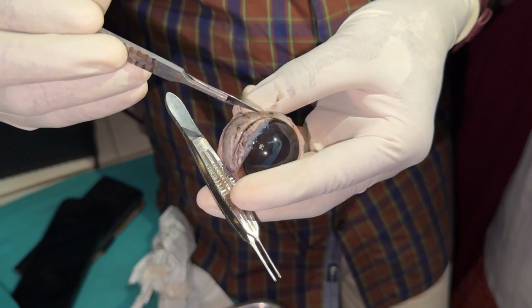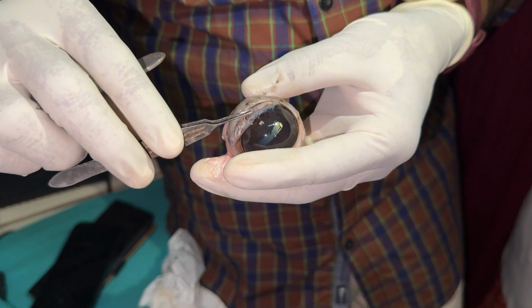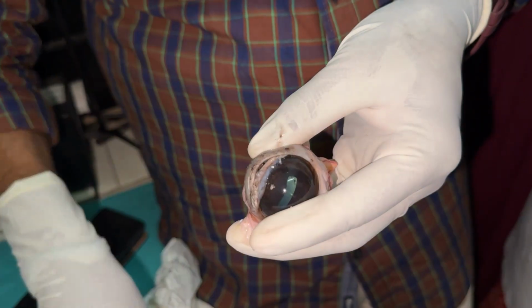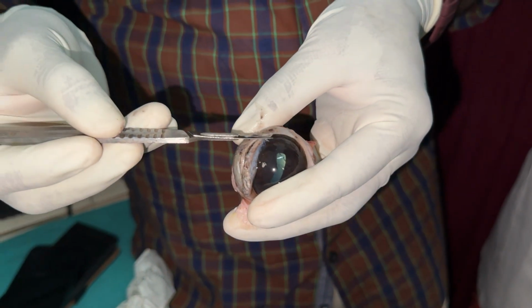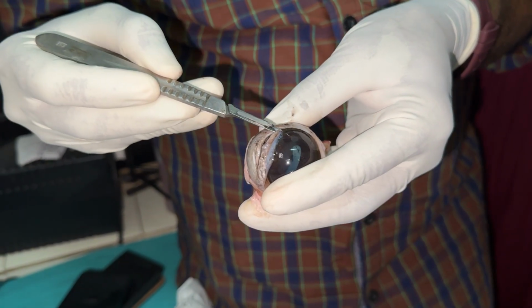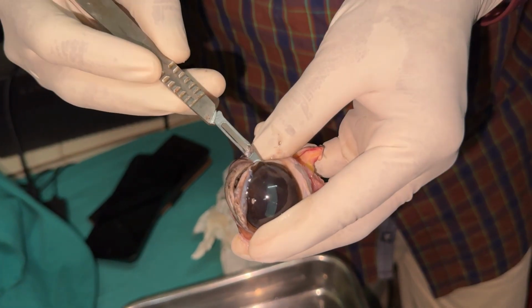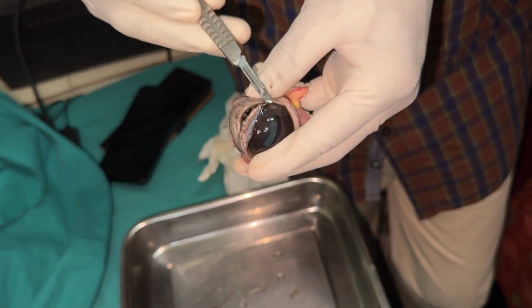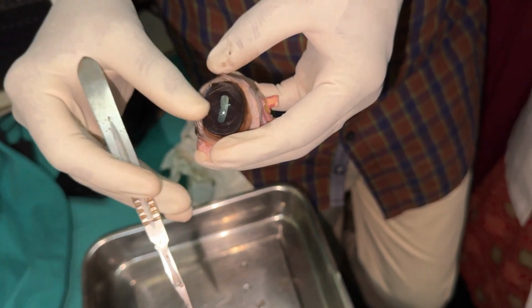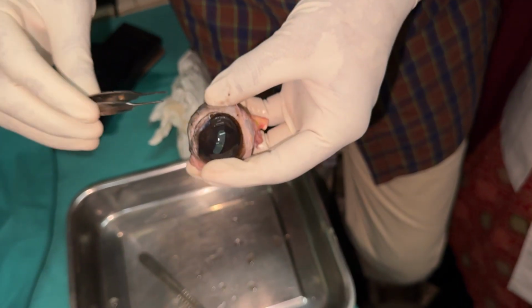Now the shape will be lost. The cornea becomes a membrane. The aqueous humor is draining out. You see? The structure of the cornea is lost, it becomes a membrane, and the aqueous humor has gone outside.